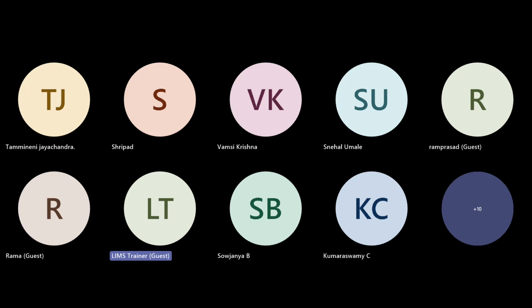Because even if you test, you need to go into the LIMS. Inside the LIMS, you need to create a sample, you need to log a sample. You will do testing by entering the values, so you should know why this is happening, why that is happening, why at the back end this is happening. I mean, anyone can do testing, but your confidence will grow when you know why you are doing this. That's my point. So it will help you.